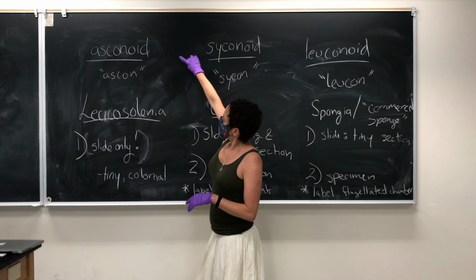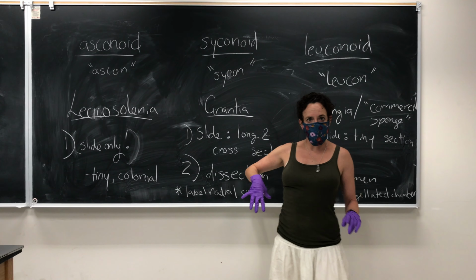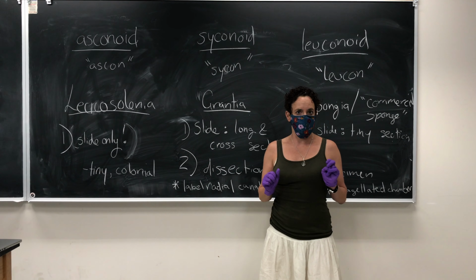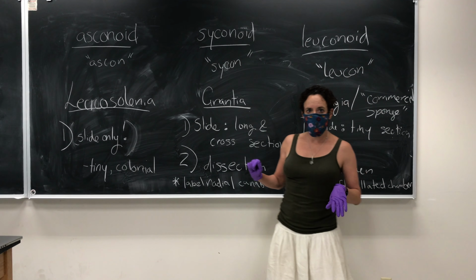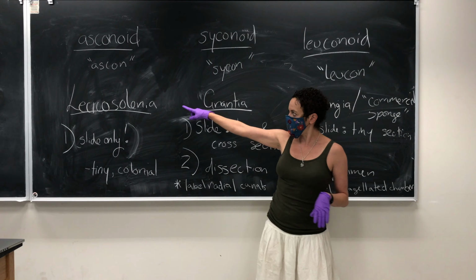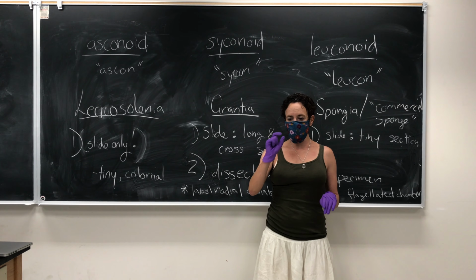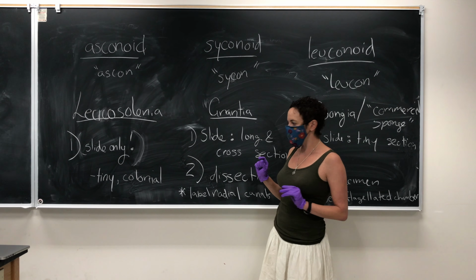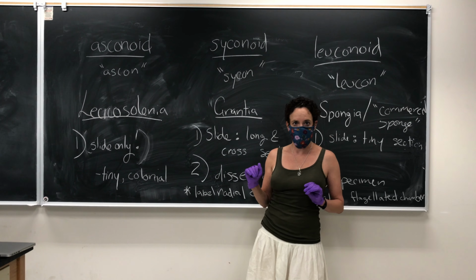So the simplest body plan for sponges is called asconoid. Your lab atlas calls it the Ascon body plan. It's the same thing. And the only specimen we have for that one is a slide called Leucosolenia. These sponges tend to be really little, so you can see them with your naked eye, but you're not going to see the structures until you put it on the microscope.